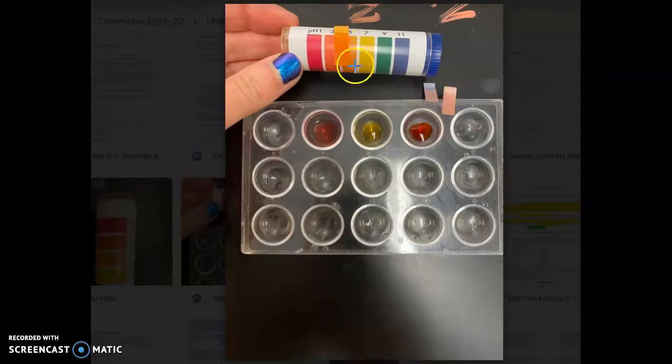The pH paper was between a 3 and a 5, so the river water itself, testing throughout the day, came out with more of a pH of a 3. This one, even though this one's between the two, so 3 to 4.